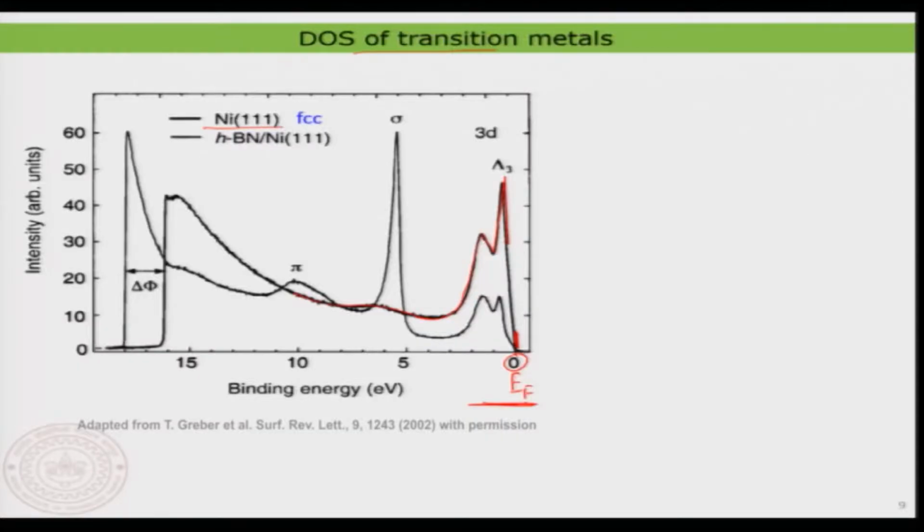That is why understanding the electronic structure of the valence band is quite important for understanding the material property itself, and that is what the application of UPS is in general.